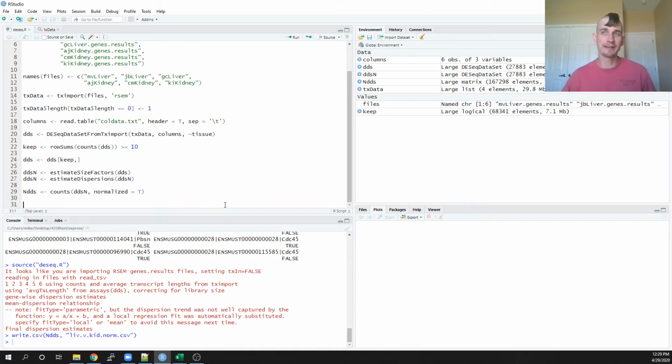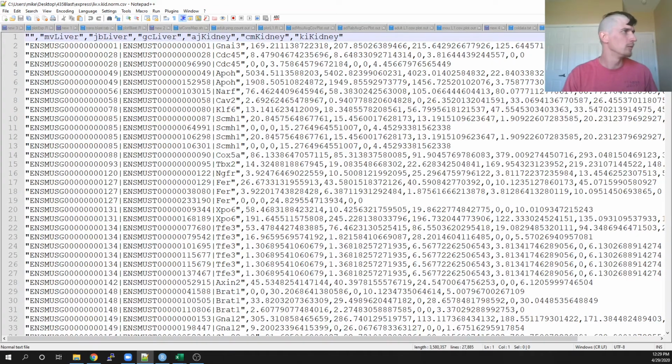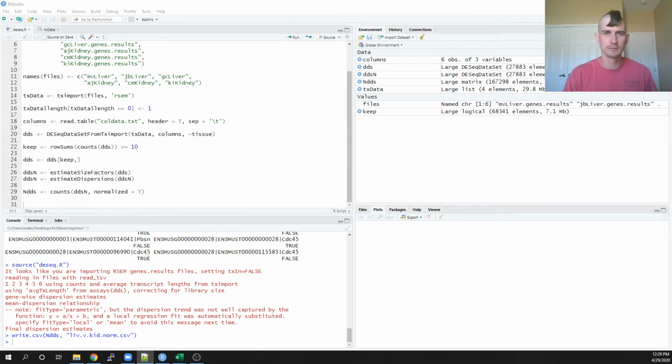I'm just saving those values for later. Bring this back over. All right. And so the actual line, I'm going to save that line real quick.